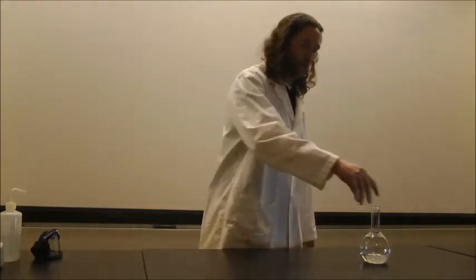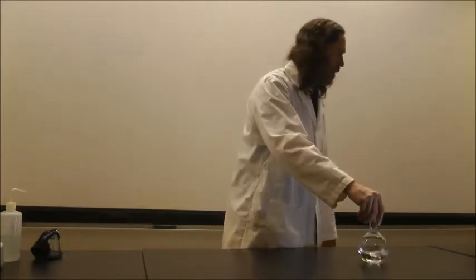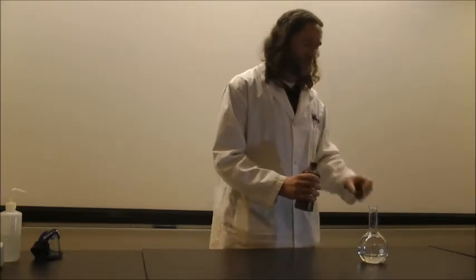One of the most important things that we can know about water is how acidic or how basic it is. Chemists refer to this measurement as its pH. So the pH of a water is something that we can measure in many different ways. One way that is very useful for us is by using an indicator.